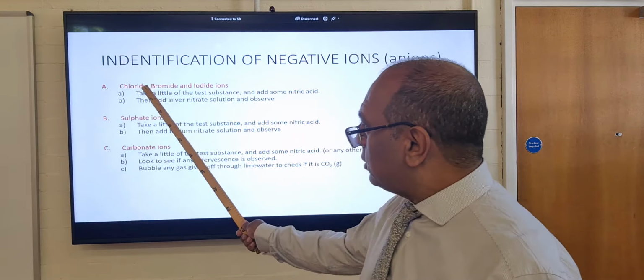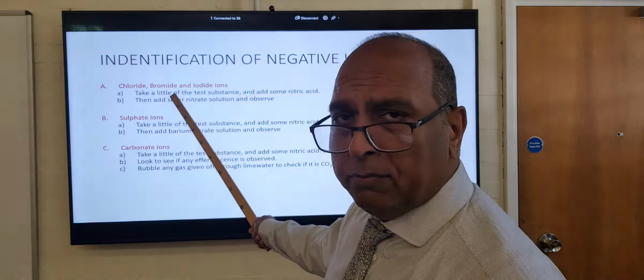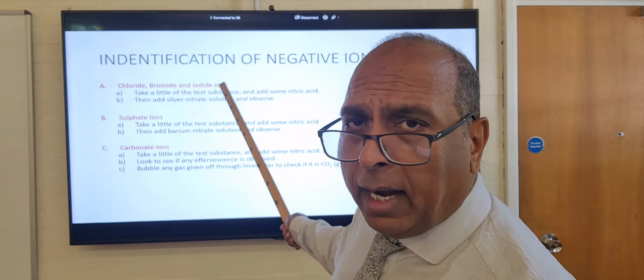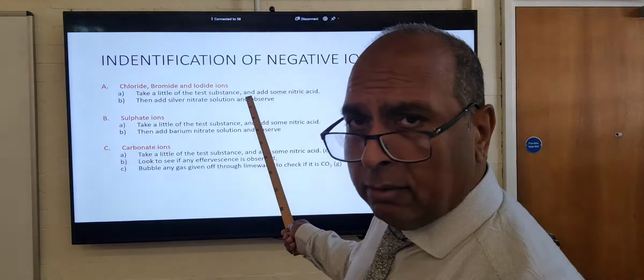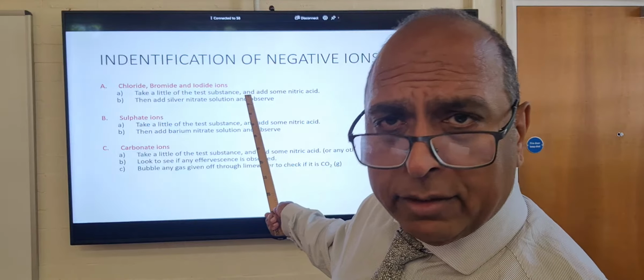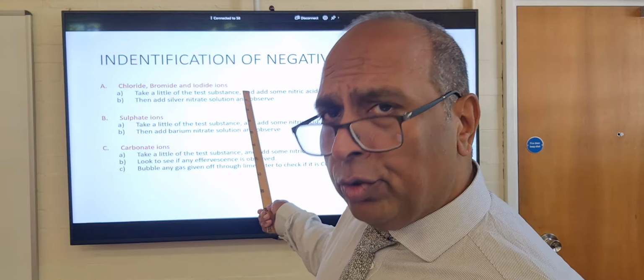So to test for chloride, Cl-, bromide, Br-, or iodide, I- ions, today when I start demonstrating, we're going to use solutions.